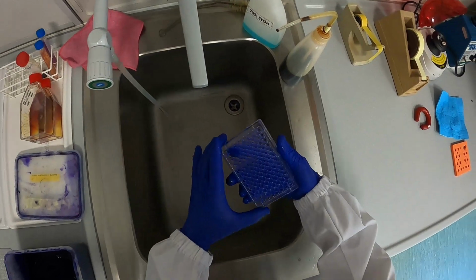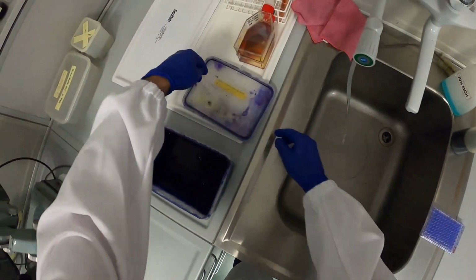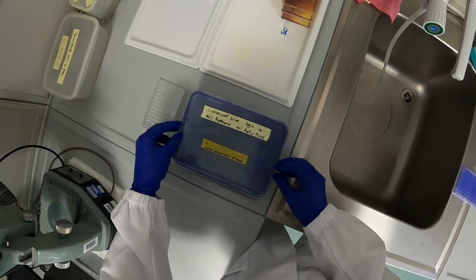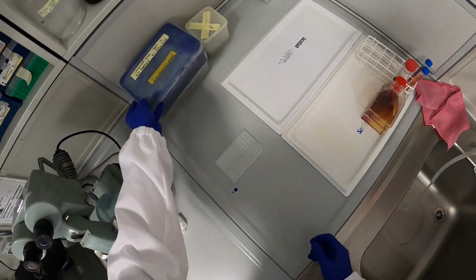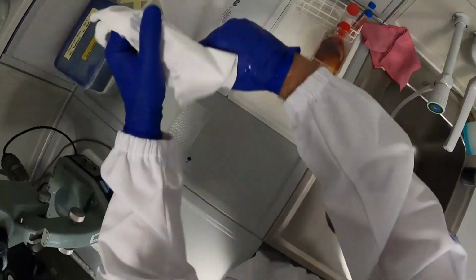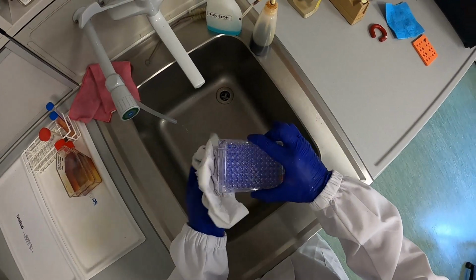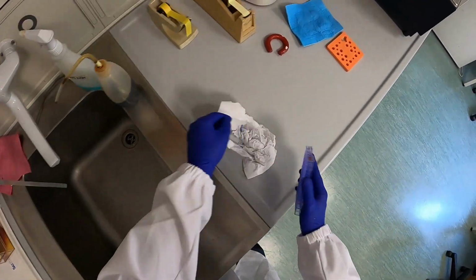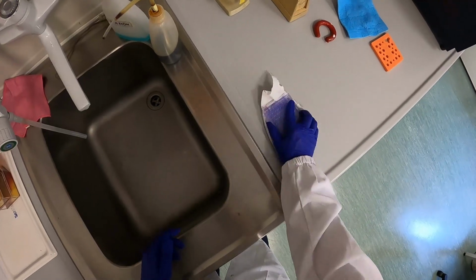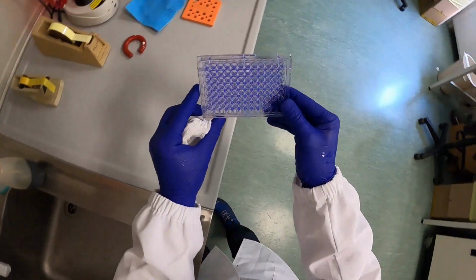And then you will see that in fact the plate remains quite blue, and that's because of the stained cells. That's a good sign. Get a piece of paper, let's wipe away all spots of Coomassie, dry the plate, just slam it to get most of the moisture out of the plate, and that looks really beautiful.